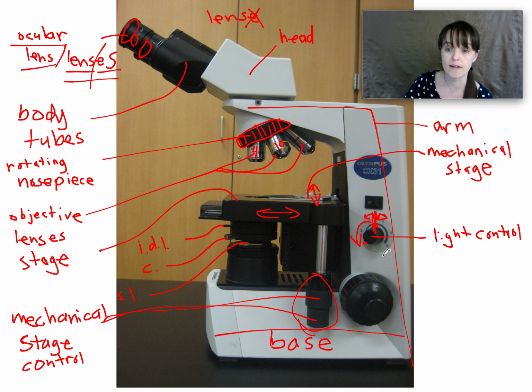Okay. And if you have it all the way up, you're going to burn your retinas out. I won't even look in them because I can see how bright it is here, because that will give me a migraine. So. And power switch, that's the off-on bit. Power switch. And then the light control.